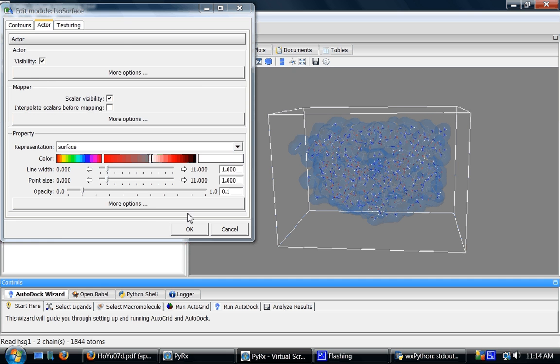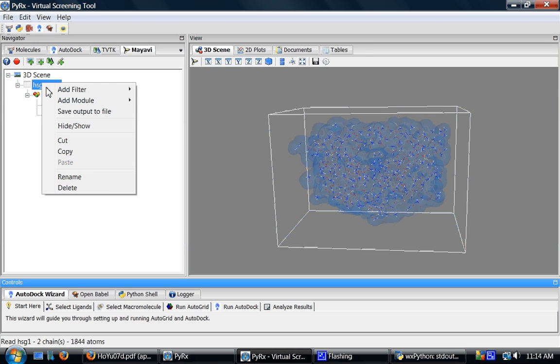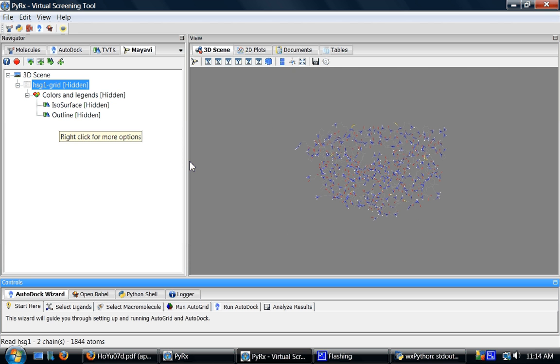I'll OK here and hide this surface since we won't need this surface for the rest of the tutorial.